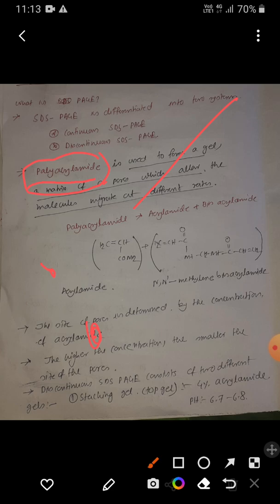What is the advantage of this? Due to the small pore size, we can separate this kind of compact particle in polyacrylamide gel better than in agarose, because agarose provides a larger pore size, and this larger pore size cannot help us separate our protein molecules very sensitively. That is why PAGE is preferred for protein separation. For nucleic acid separation we cannot prefer PAGE because they are relatively larger in size. If we use PAGE for nucleic acids, our molecules cannot move, so separation cannot be established.